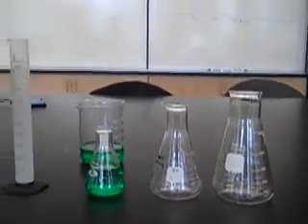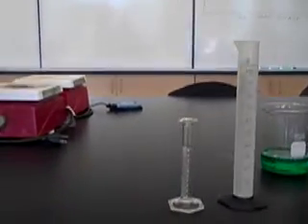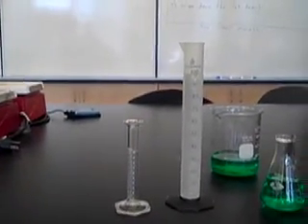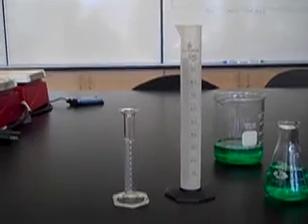Graduated cylinders have a lip much like the beakers, but are more accurate and easy to read because they have more tick marks. If measuring 9 milliliters of liquid, use the 10 milliliter graduated cylinder.